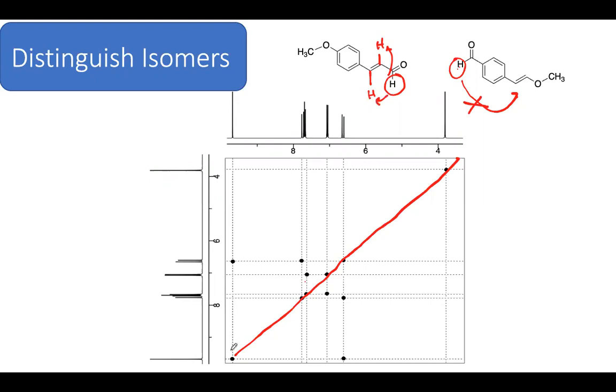And so if you look, here's my aldehyde and it is coupled into that peak. I'm not seeing this one. Sometimes you have to go to a different slice because this is actually a three-dimensional spectrum. But it's pretty clear that I have a strong coupling to one of these double bonds. And so this is the product that you have in here. The other peak here is a methyl of the methoxy and it's not coupled to anything, but we have the coupling of the aromatic allyl with the conjugated system.